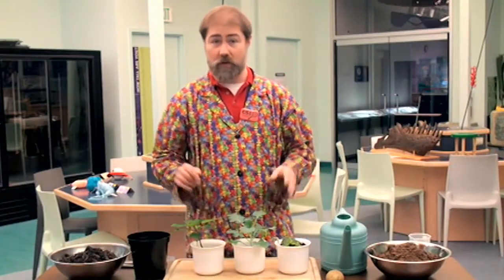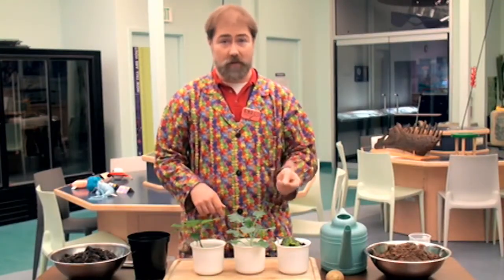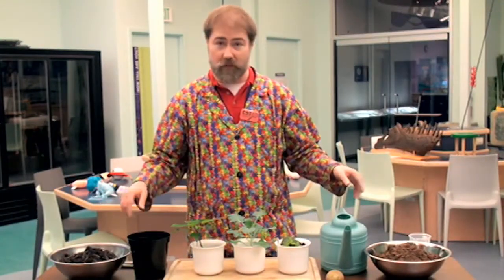Today, we're going to show you how to clone another type of plant, the potato. I have all the materials here that we need. It's easy enough that you can do this at home.